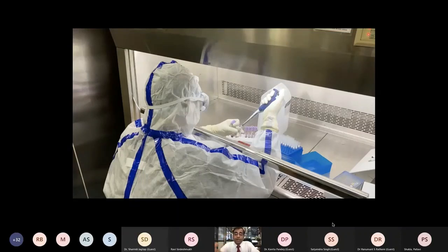But after we have done these experiments, and now we know these are some set of proteins which are very interesting, the targeted validation could be done only on those peptides, and now we can also use the crude plasma, which is undepleted. It is possible some peptides we may not see if they are low abundant and not enriched sufficiently, but most likely we will be able to see most of the peptides.